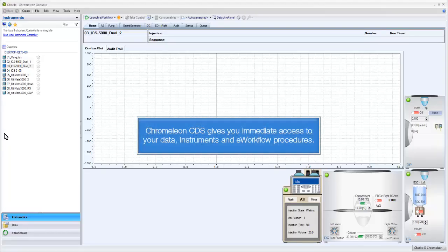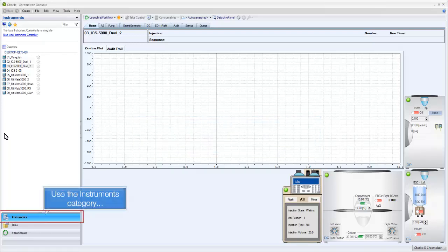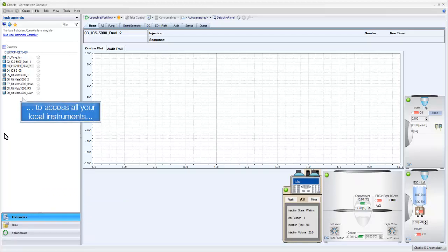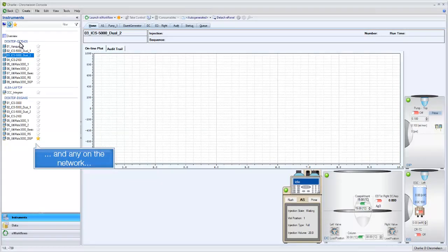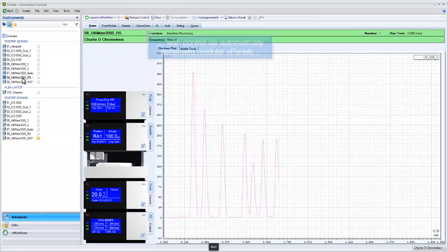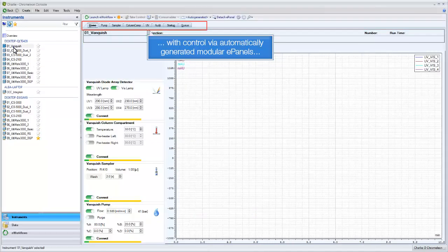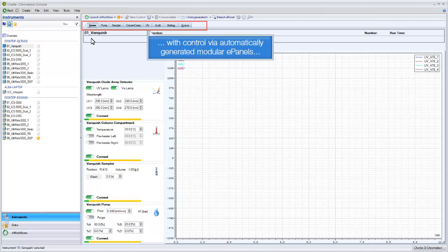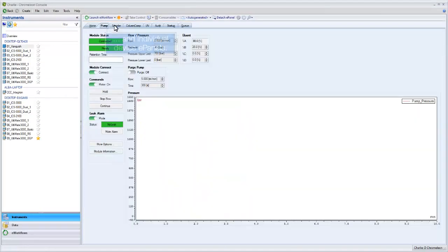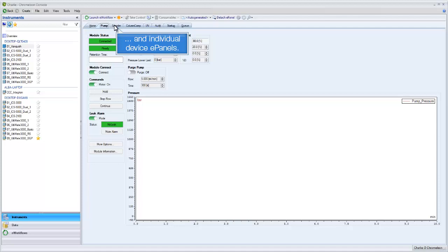Chromelion CDS gives you immediate access to your data, instruments, and e-workflow procedures. Use the Instruments category to access all your local instruments and any on the network, with control via automatically generated modular e-panels and individual device e-panels.